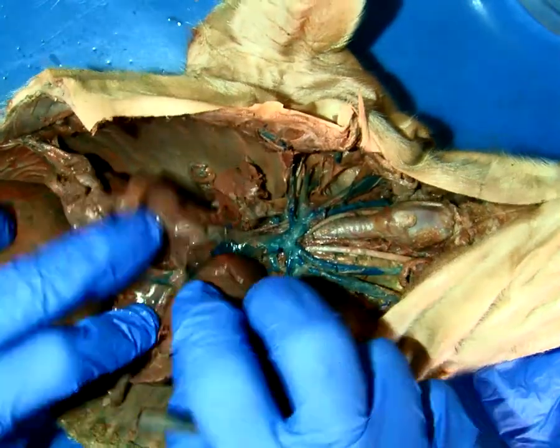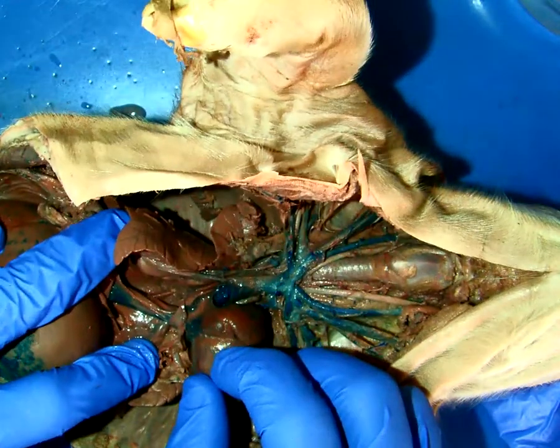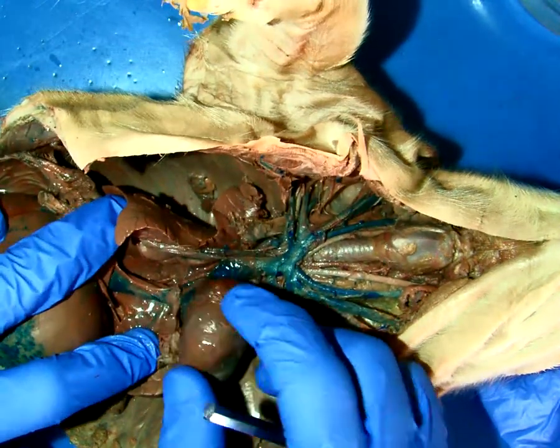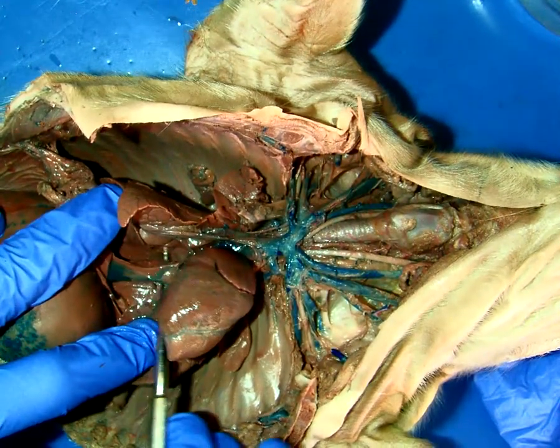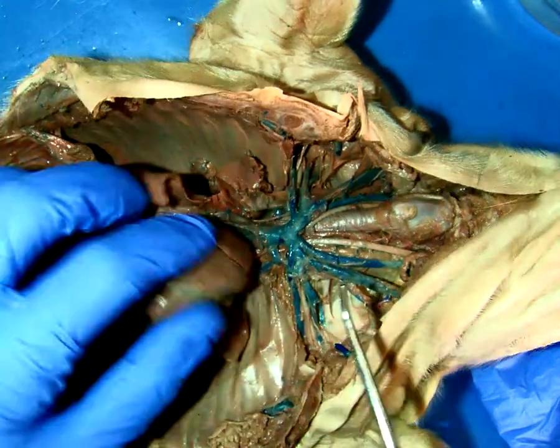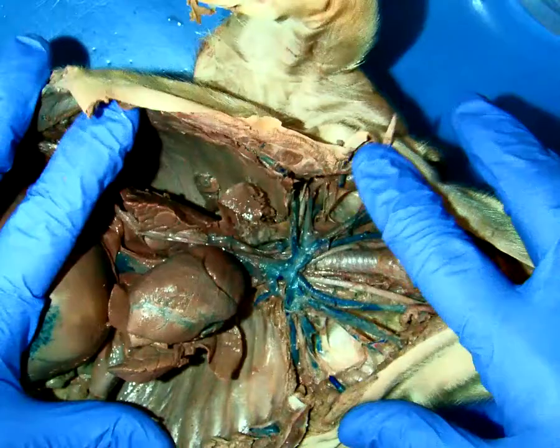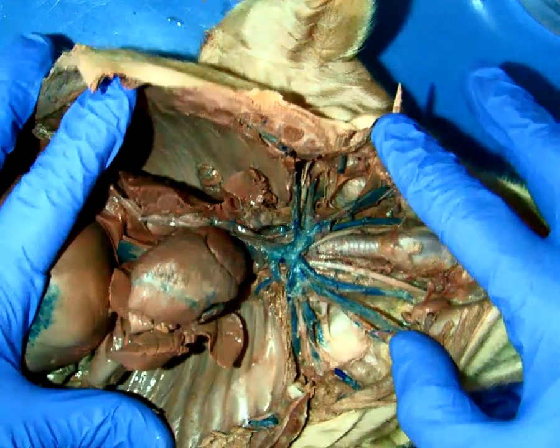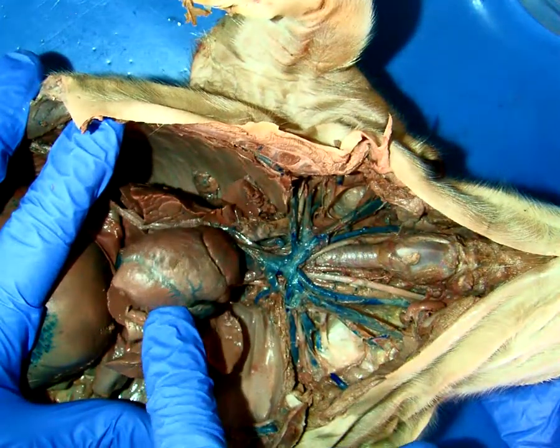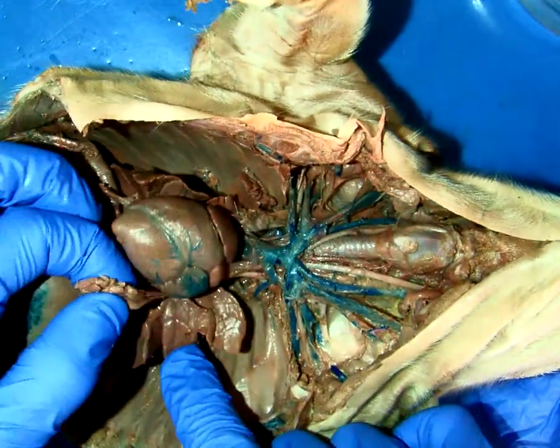Right? If we move the heart aside now, it's very evident that those two vessels come into the right atrium. Hopefully you can see, again, that inferior vena cava coming up. Okay? So that would be your thoracic cavity and the vessels we'd expect you guys to know. And if you get really lost, like I said, just start with the heart and kind of try to piece together where things are going to.